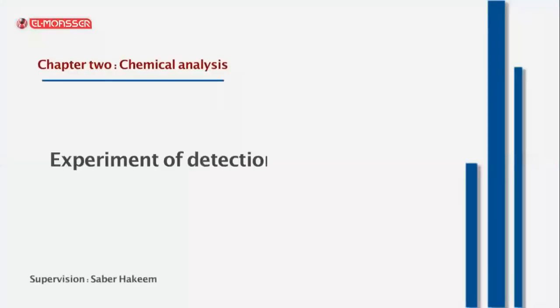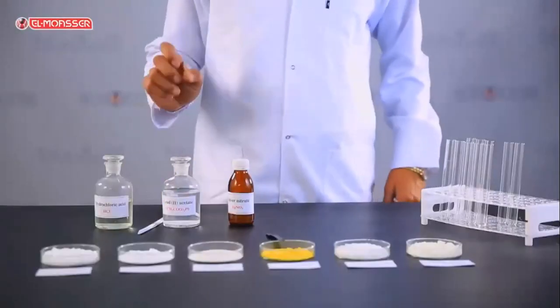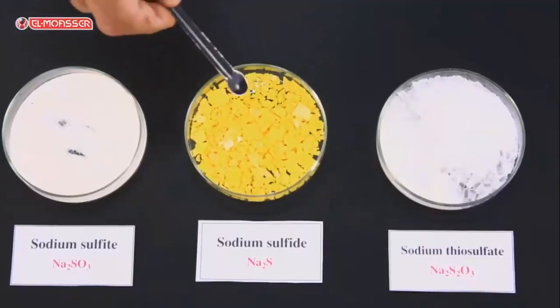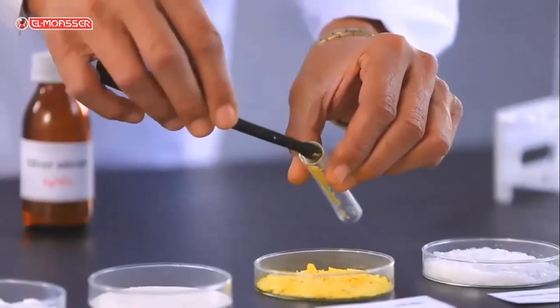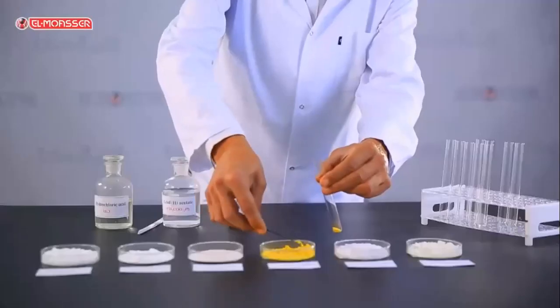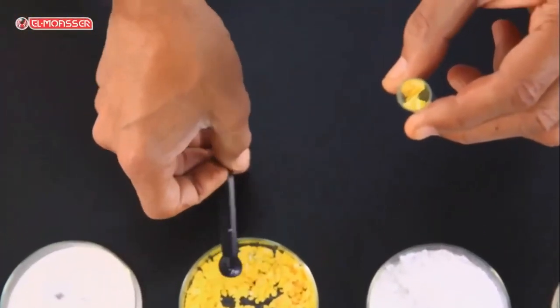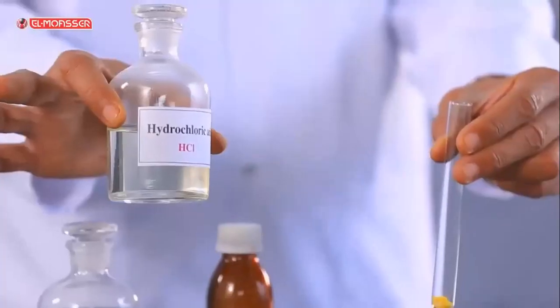Experiment of detection of sulfide anion. Sulfide anion is detected in sodium sulfide salt by a main experiment and another confirmatory experiment. Main experiment. Add to sodium sulfide salt drops of the group reagent, the diluted hydrochloric acid.